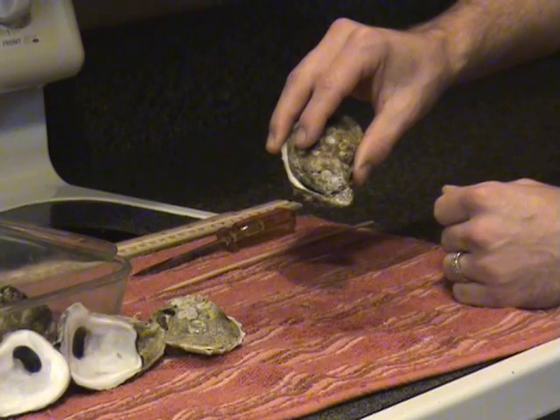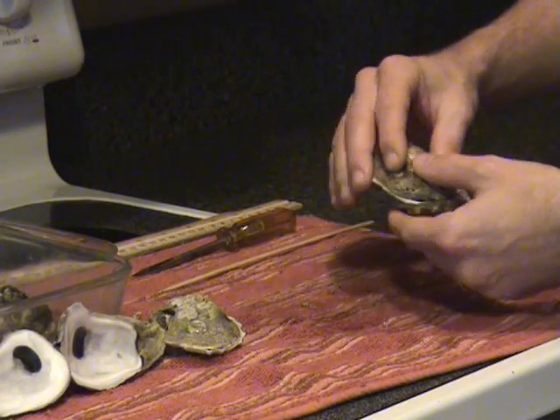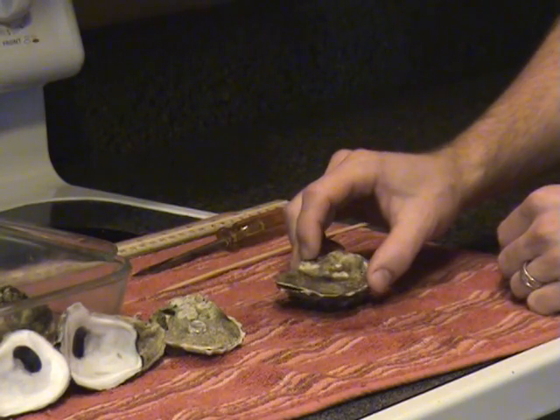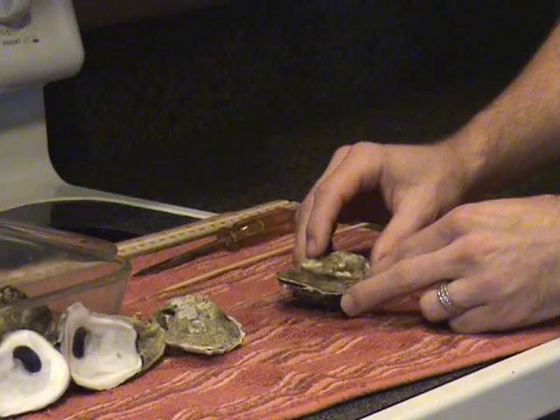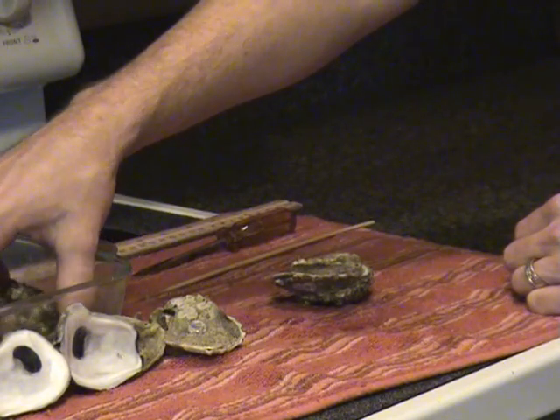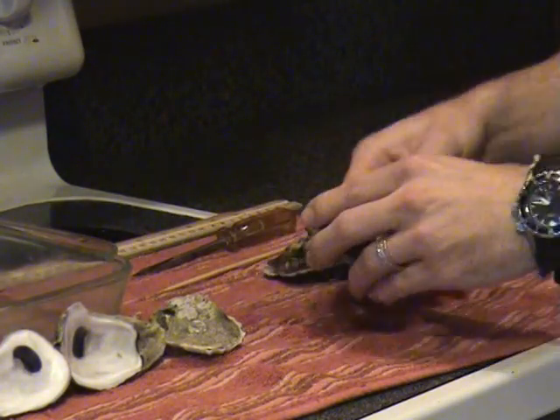Now we're going to shuck our oyster. We'll be using the hinge method. Place the oyster left valve down — remember, that is the longer of the two. Place it down on a hard surface with the umbo pointing towards you, that is the more pointed end of the oyster.